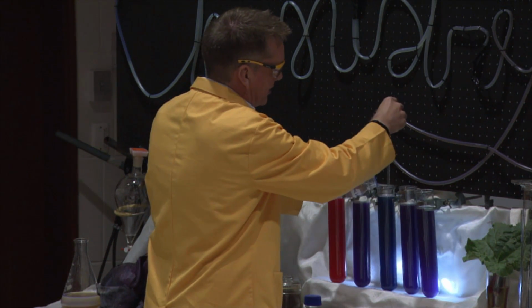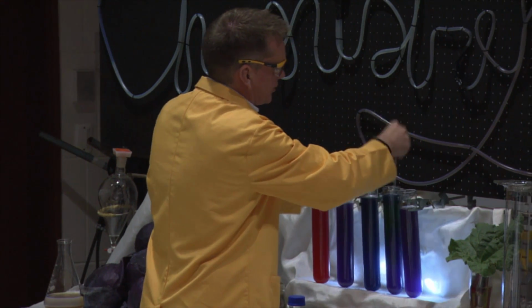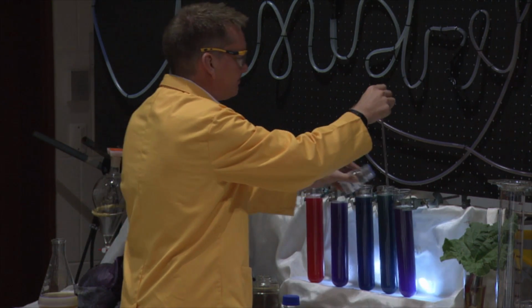Okay, that's sort of getting there. I'll add a bit more to this one, I think. And we get quite a green colour for this one.